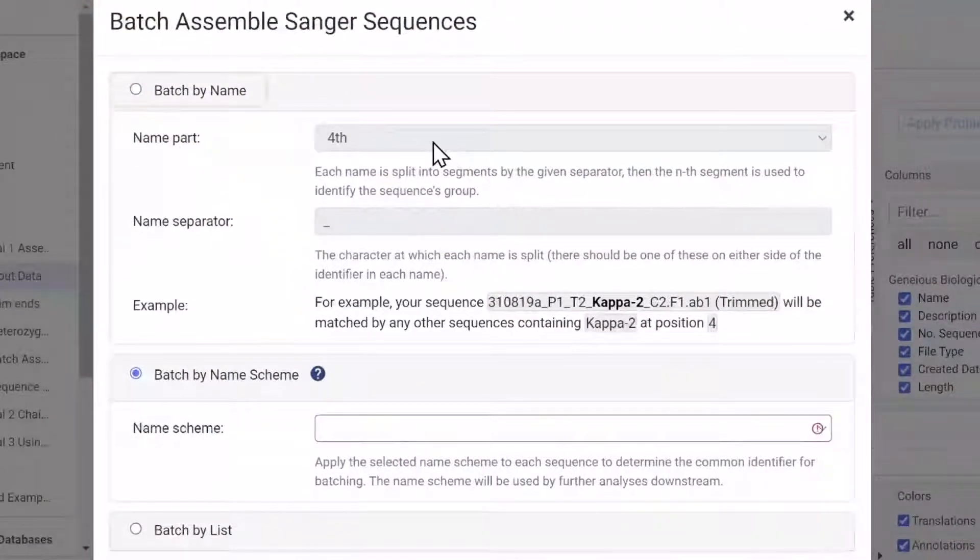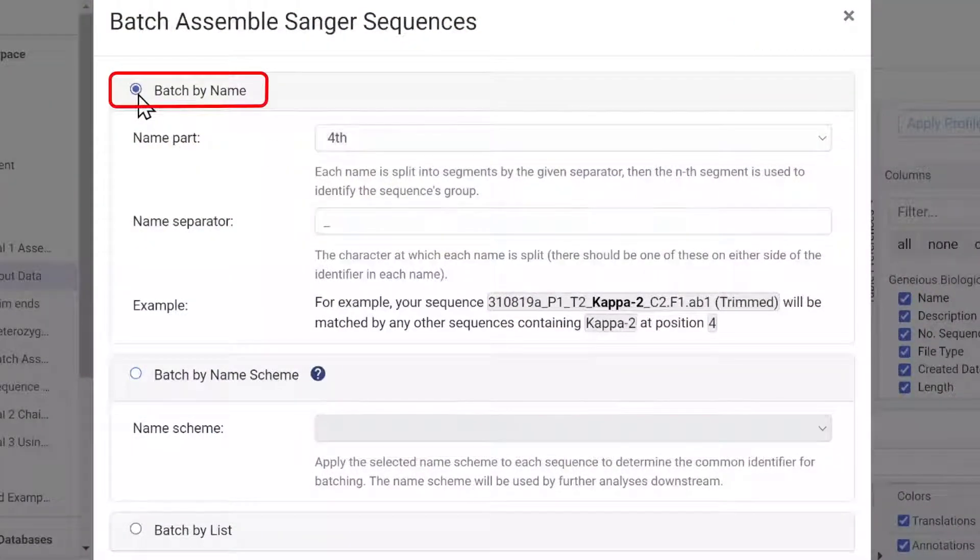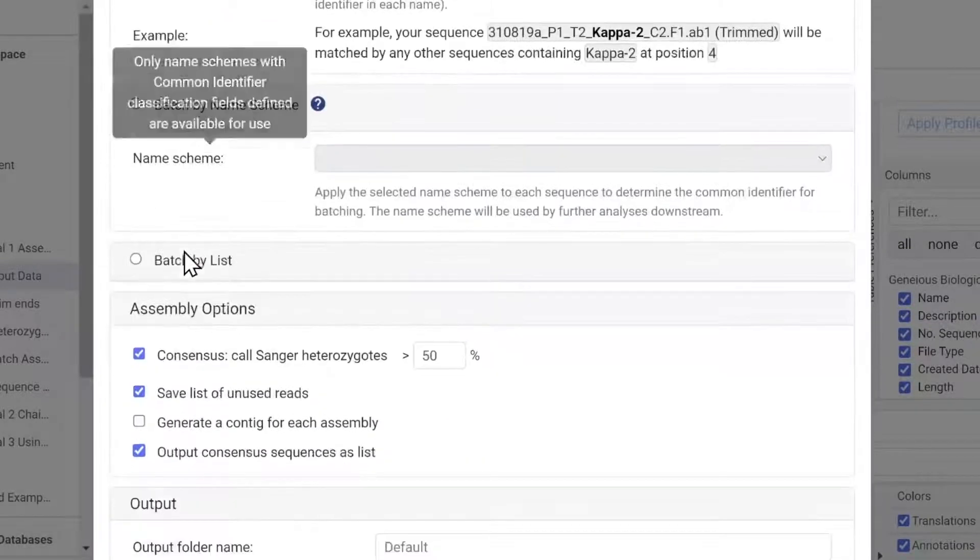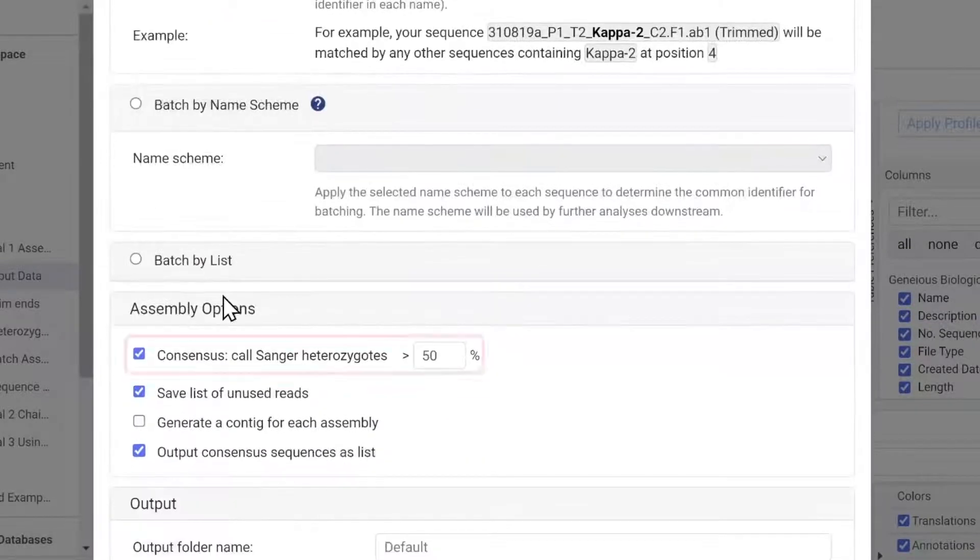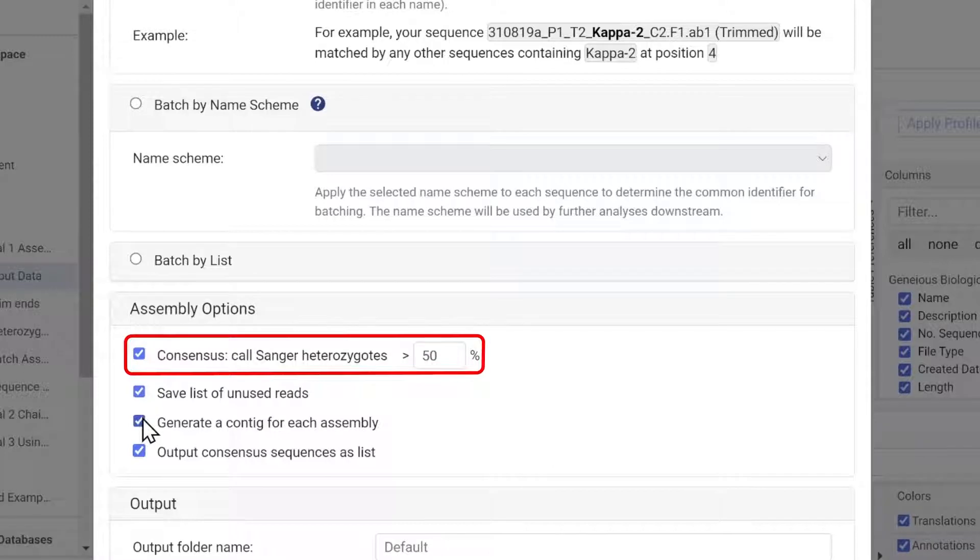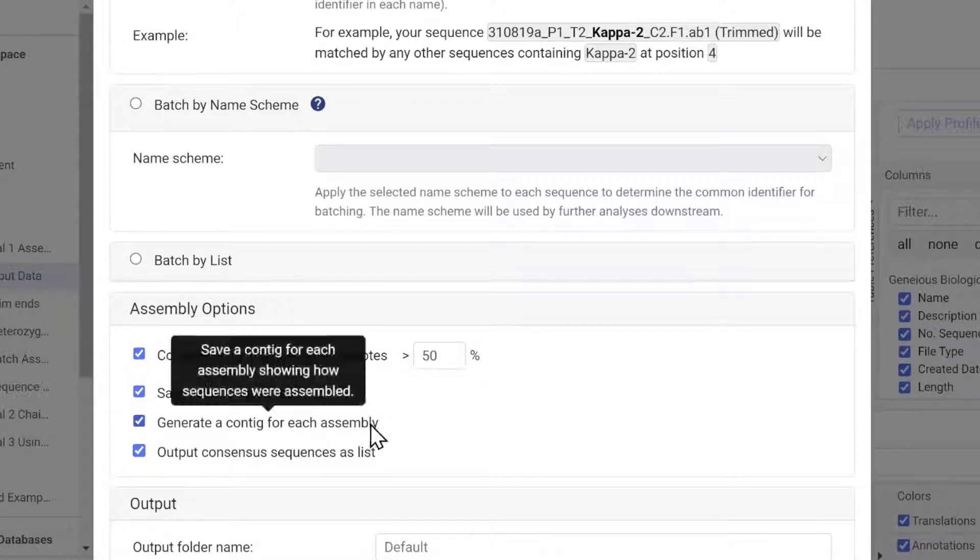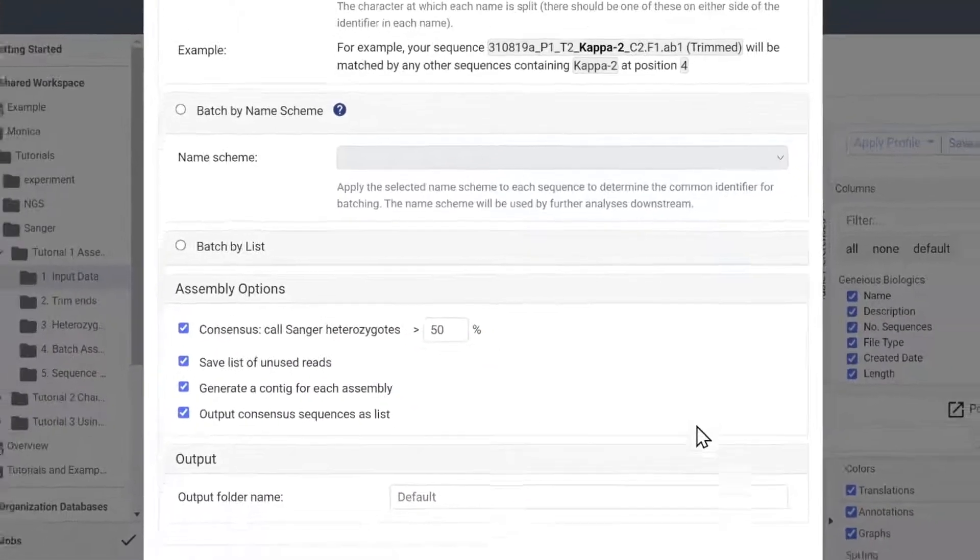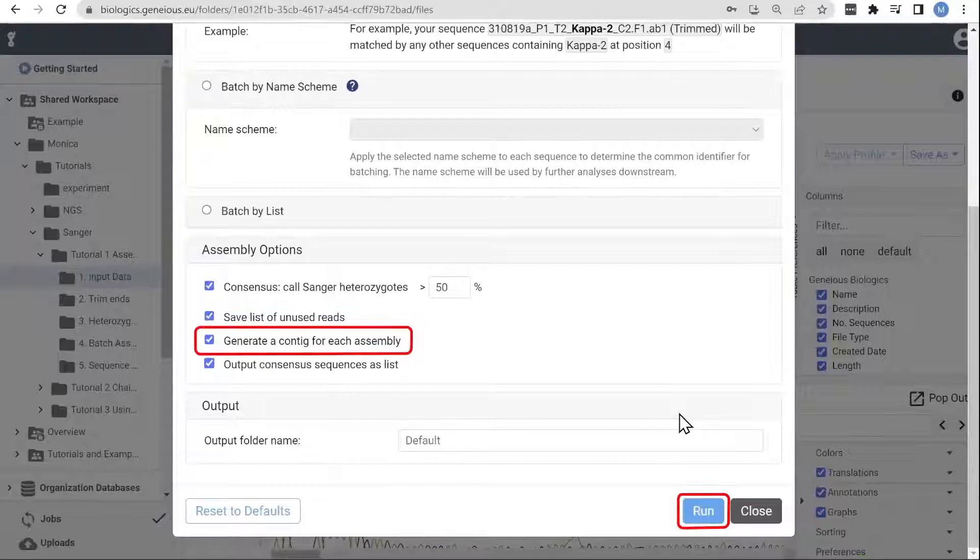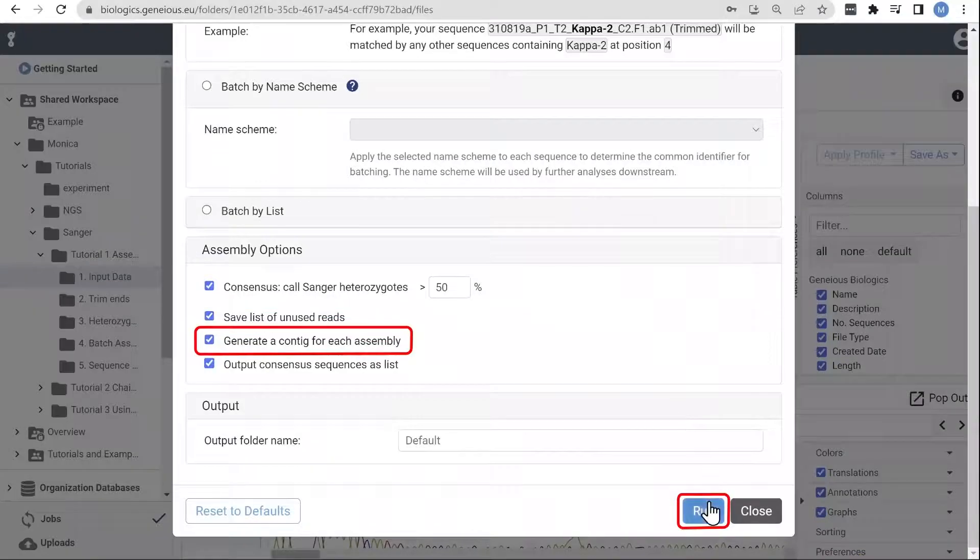In this example, we'll be using a part of the file name to match forward and reverse reads. You can also choose to annotate consensus heterozygotes at this step. We have chosen to group consensus sequences into one document list, as well as generate individual contig sequences.